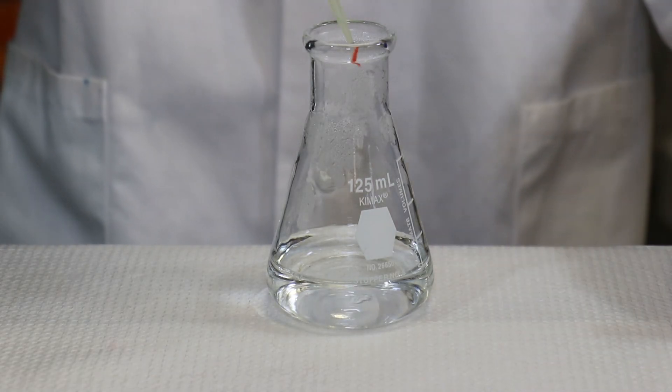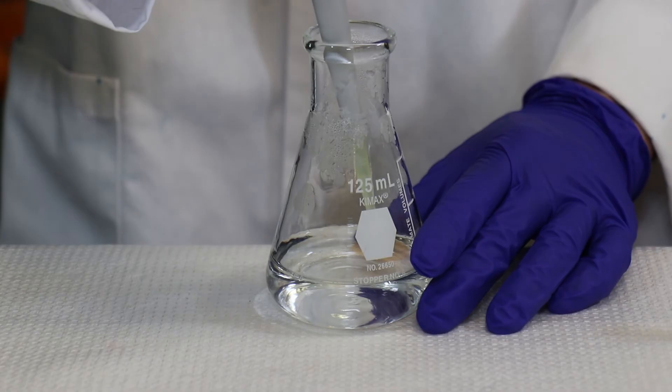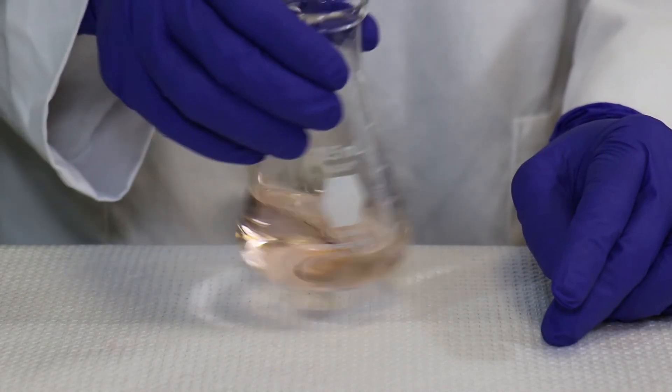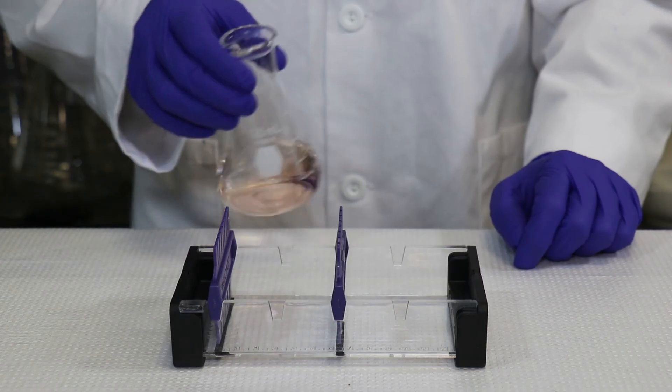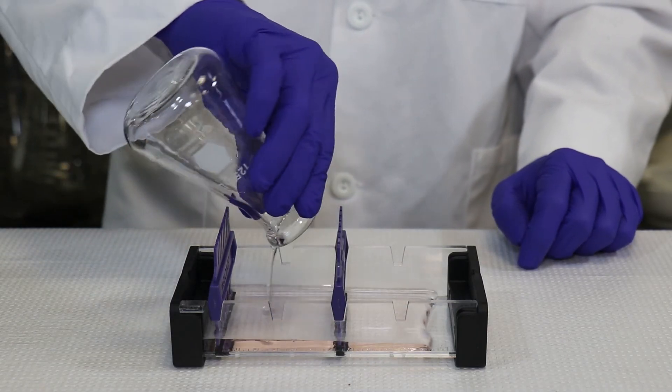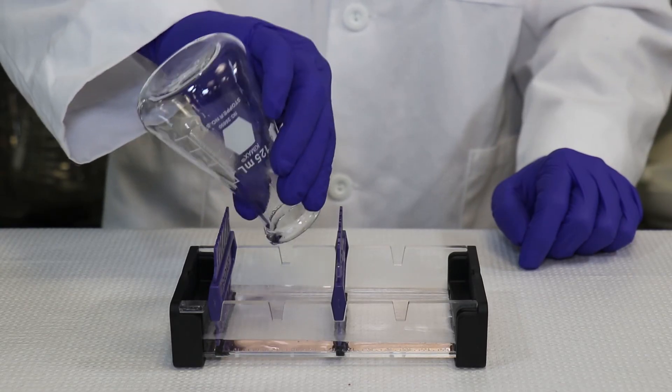Step 5: Before casting the gel, add 25 microliters of diluted CyberSafe to the cooled molten agarose and swirl the flask to mix. Step 6: Pour the cooled agarose solution into the prepared gel casting tray. The gel should thoroughly solidify within 20 minutes.